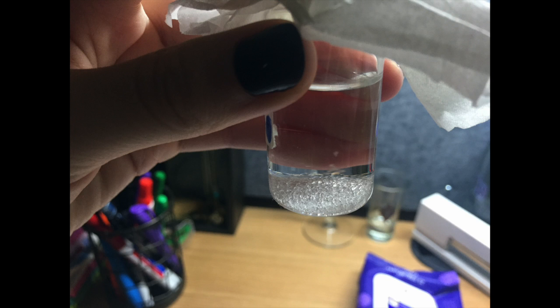This week, a few more crystals have grown on top of the old ones, and they are slightly larger in size. I have kept them on my desk away from the window or heater so that ideally it is at room temperature constantly and will not be affected by the elements.